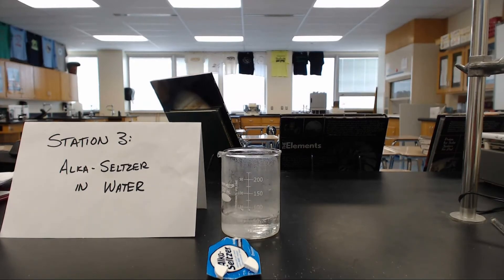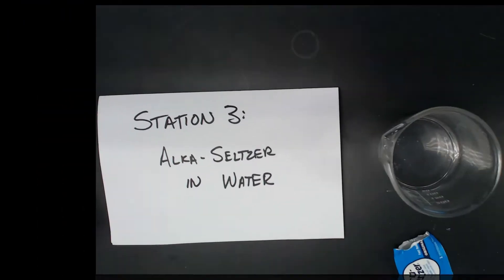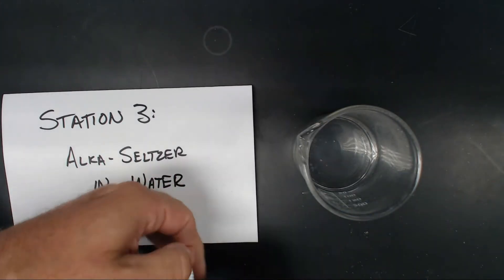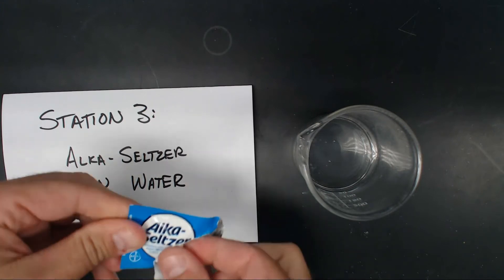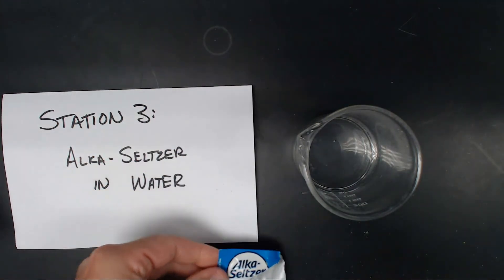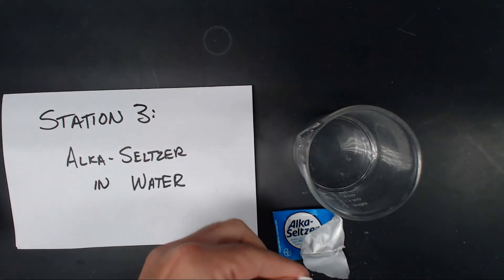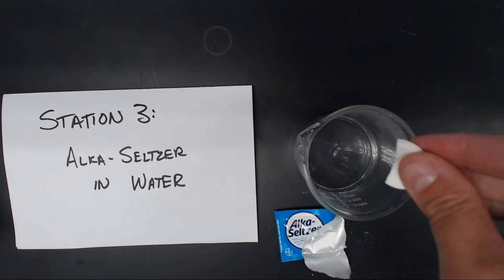We'll do a replay and I'll do it from overhead — top view. I'm going to take the tab of Alka-Seltzer that we have, split it in half, take half of the tab, and put it right in the water.